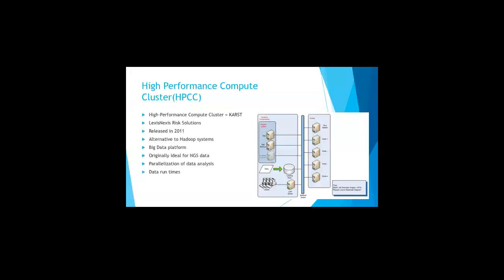And as Dr. Liu mentioned last week, once you submit a job to KARST or to Big Red, it may not run right away. You may have to wait a little bit. And to give you an idea, when we do whole genome sequencing, those jobs, once we get into the queue, can run for 72 to 96 hours. So it could be 3, 5, 7 days. So be patient. Be patient with your data and always check the status of the run that you've submitted.